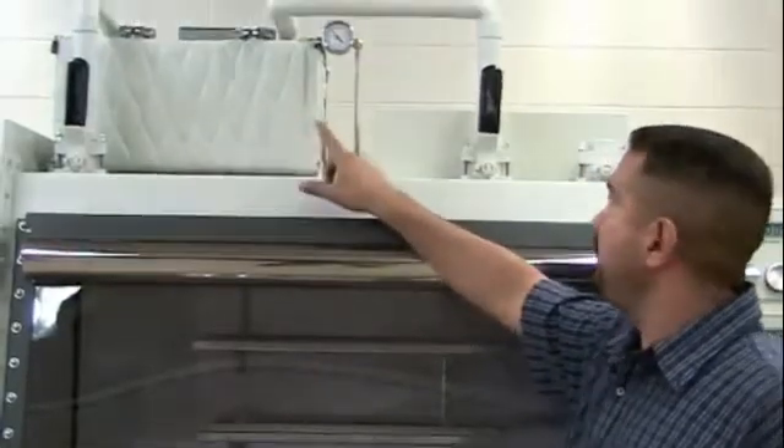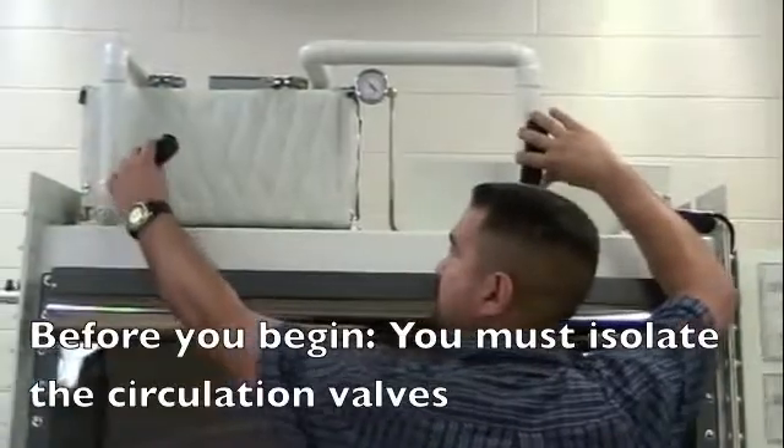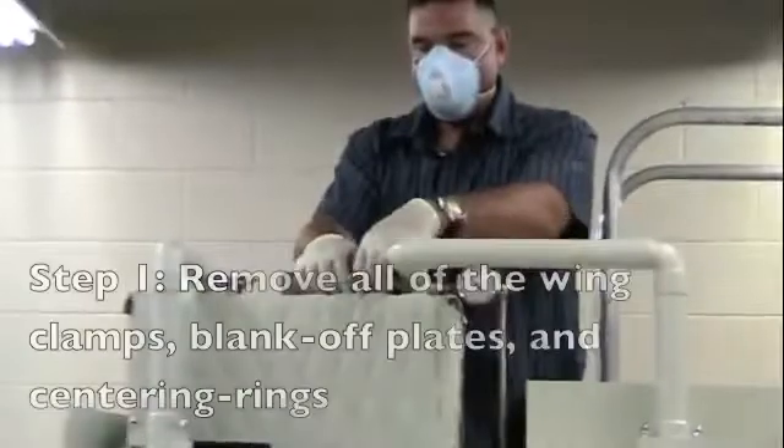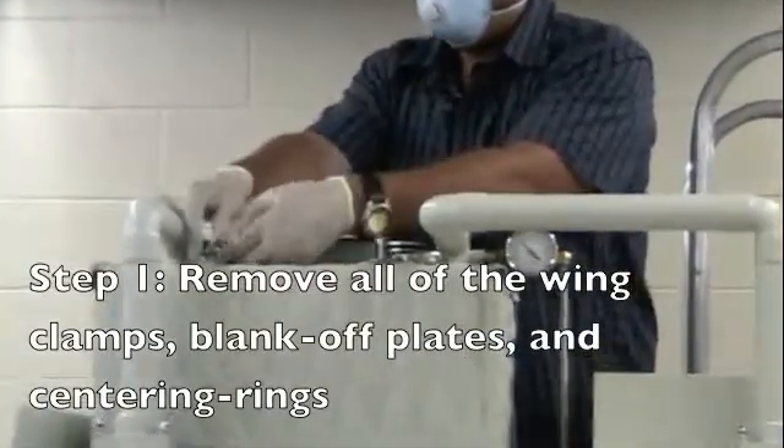Before we begin, please make sure that you isolate the circulation valves to isolate the purifier from the glove box. Remove the wing clamps, blank off plates, and centering rings from the purifier service ports.